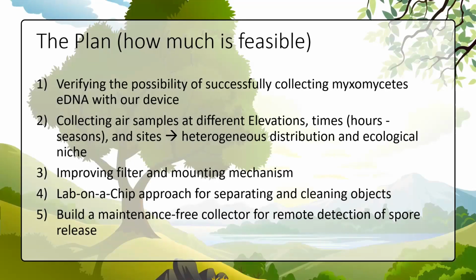Yeah. And with this slide, I will finish my talk about future plans with this device: optimizing the entire device, especially reducing the contamination risk as much as possible, and looking into this lab on a chip approach so that we have a whole system running around this air sampling system. Yeah. Thank you so much.